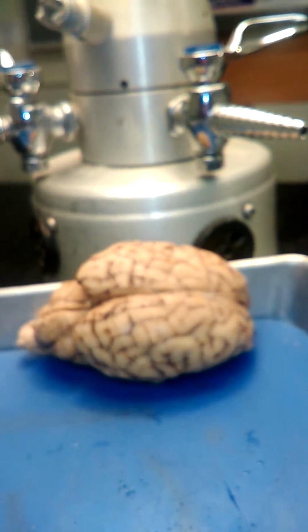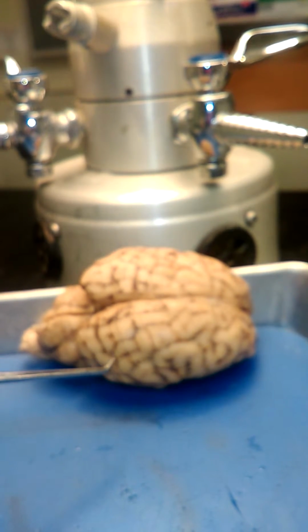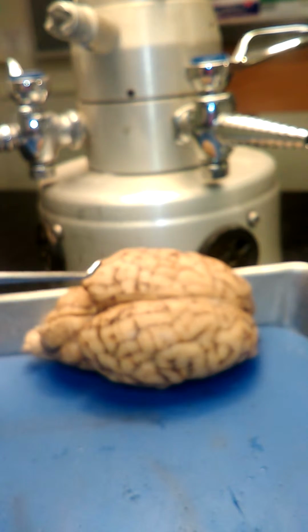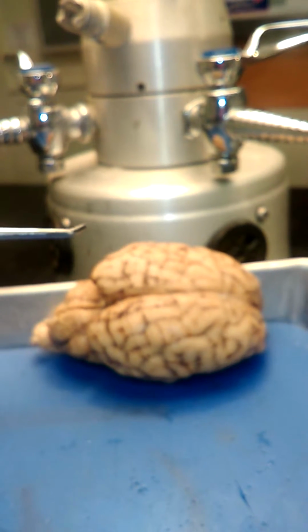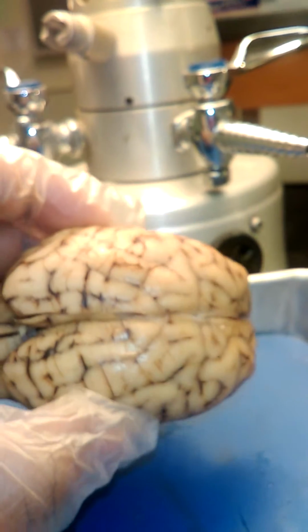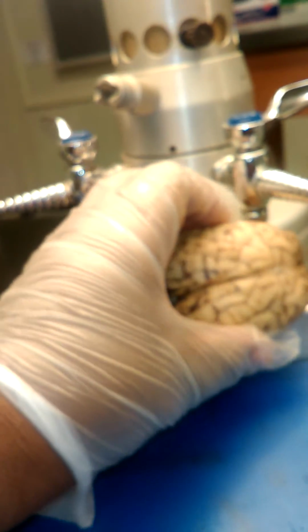Today in Biology 2401, I will give you a quick, very brief overview of the brain. We're going to discuss several things about this brain, but I want you to know that it won't be all parts of the human brain because I am using a sheep brain at this time, okay? So to begin, I just want to show you the brain itself. We're going to discuss all of that, okay? All right.